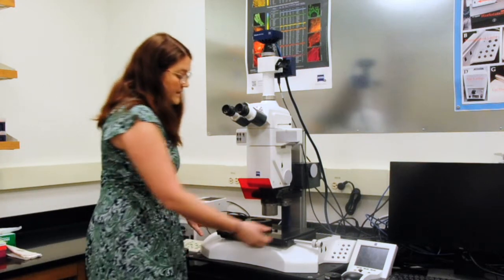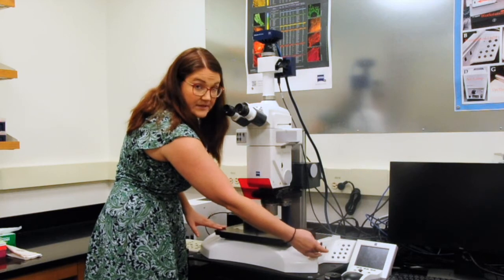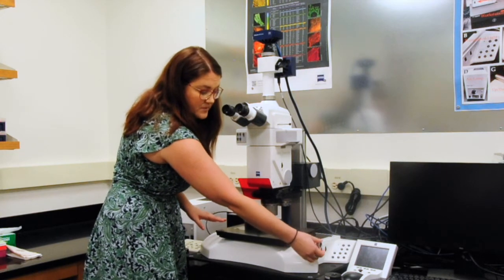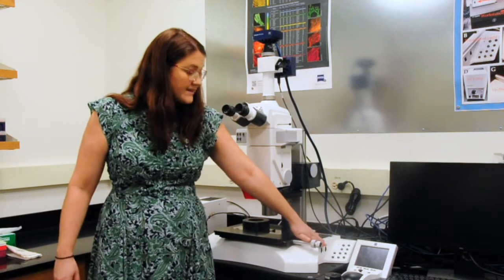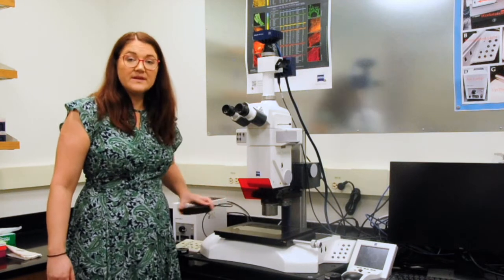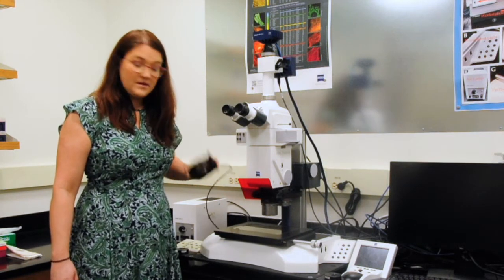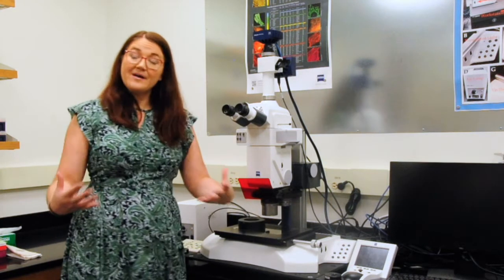This microscope has a stage that is manual, so we just have our little thumb screws here. But over here, we have a variety of different ways to light from a transmitted standpoint, as well as we have an LED ring light to illuminate from above when that is the better option.